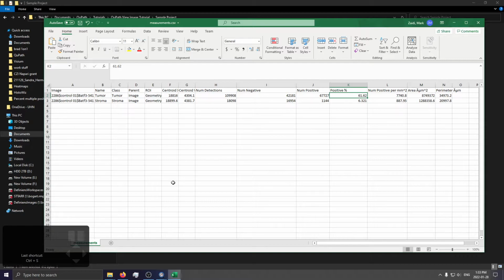And yeah, I hope my screen was recording because I do not see an outline. Ah, perfect, it was.